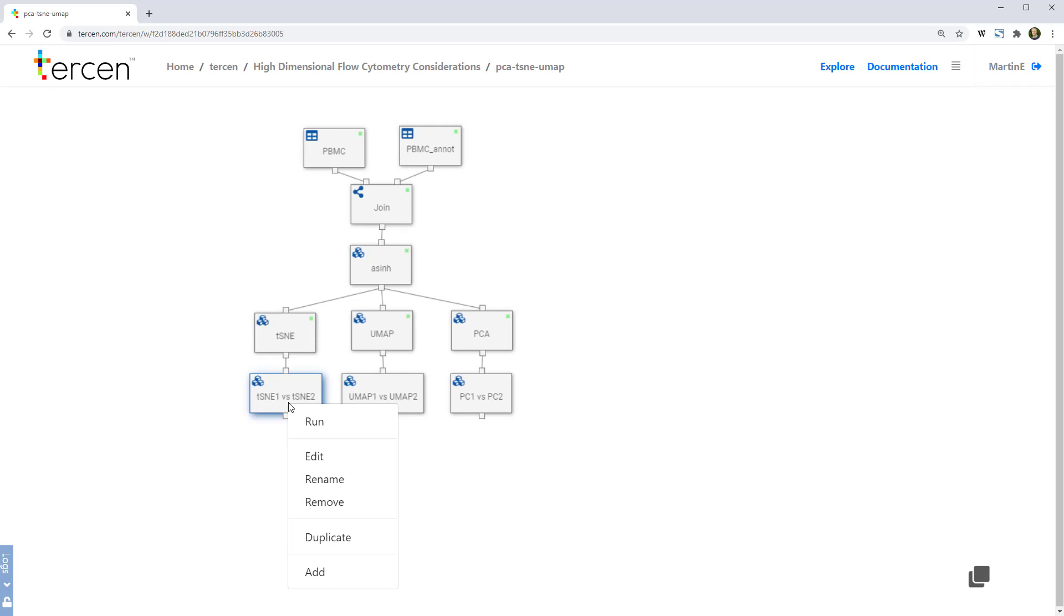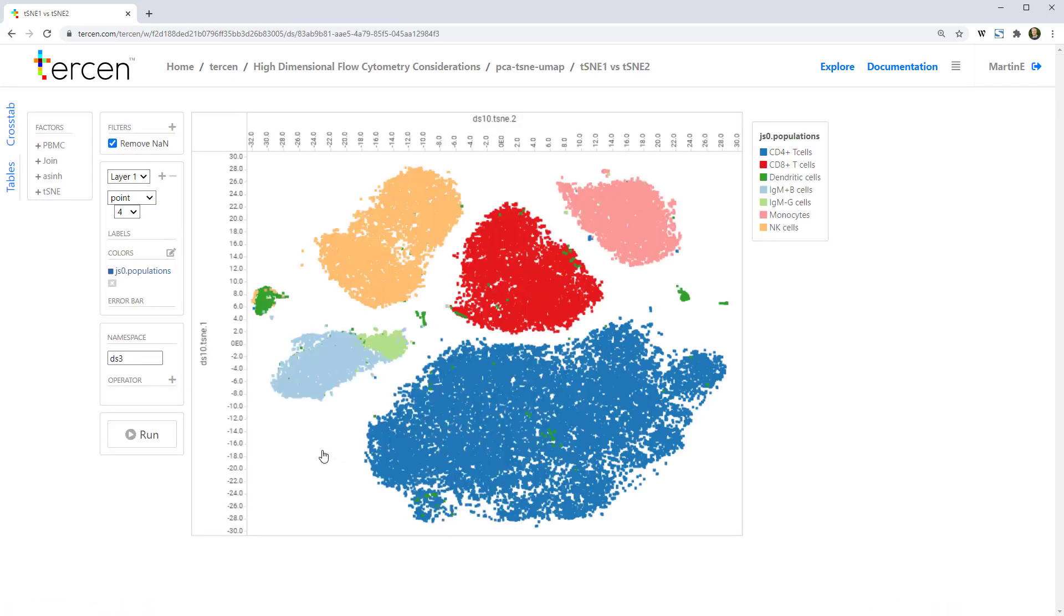It shows different cell populations with high dimensions to be reduced. We can see how t-SNE has done quite well here. Take note of the CD4 and CD8 T cell populations, so we can compare to the other graphs.